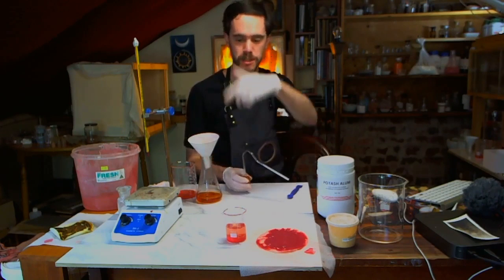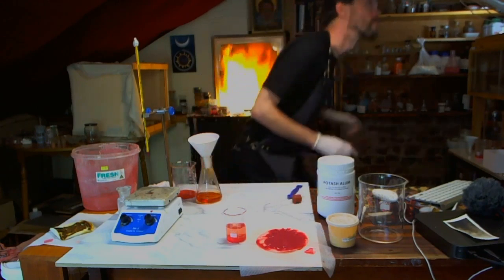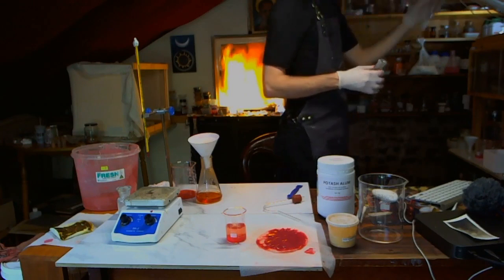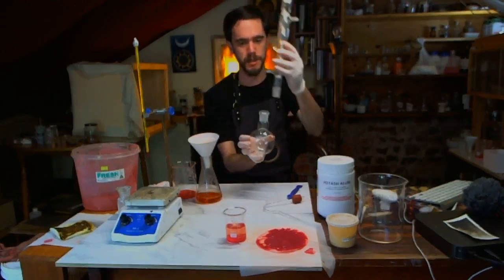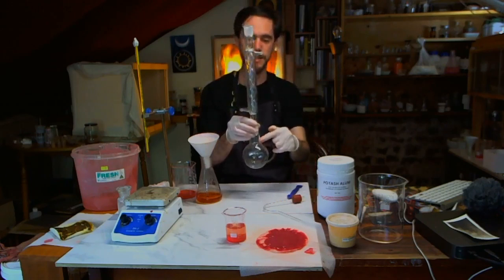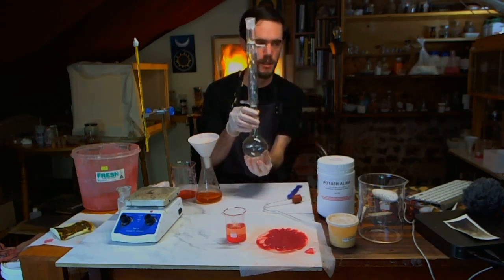Or you could use a reflux scenario. What you could do is put your lead in a round bottom boiling flask and then put a condenser on top and run the water through so that your acetic acid just vaporizes up, condenses, and then just drips back down, and then you're just refluxing the thing.